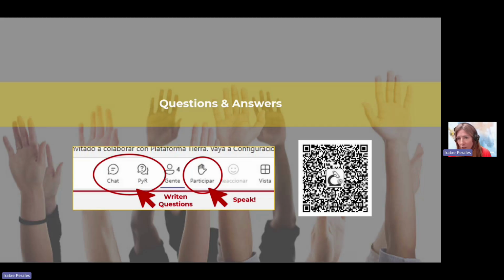I'm wondering if we can quantify the starch content in the sample. Yes, we can. I already explained. You can check on the website the range of starch content for which we provide warnings. So we count the number of starch grains that we find in the analysis. We provide you with an estimation like yeast, and then depending on the range, we provide you with warnings. We always say that if it's above 10-15% compared to pollen grains, this is not normal and you should check your honey.